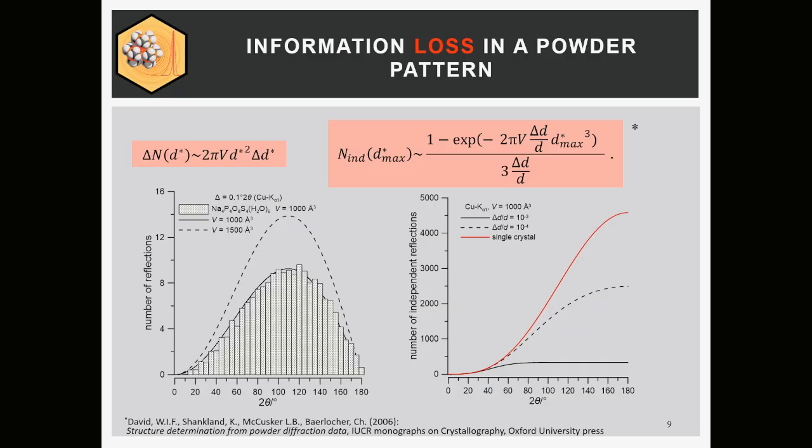And you see, wow, at the beginning it's not that many, but if you reach 60 or 80 degrees, we have in this small area something like 6 to 8 Bragg peaks in there. And it tells you immediately, now everything depends on your resolution. If your resolution is bad, you have no idea how to distinguish these peaks.